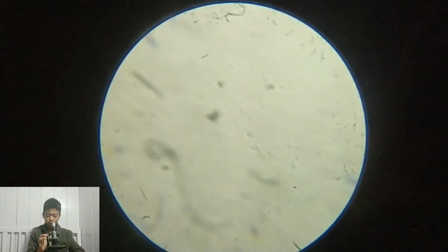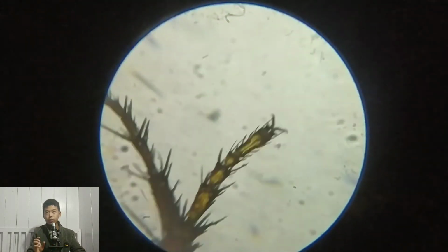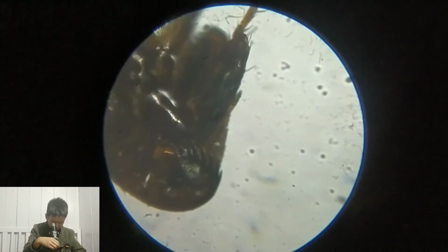So friends, I previously told you they can jump up to 3 inches or 6 inches, and it is 100 times more than its body length. You can also see the hair structures present on it. The hairs are attached, or we can say they are together with that organism. So more or less this specimen is good to observe.